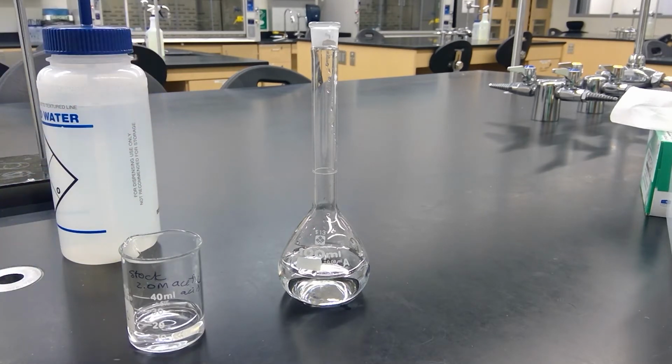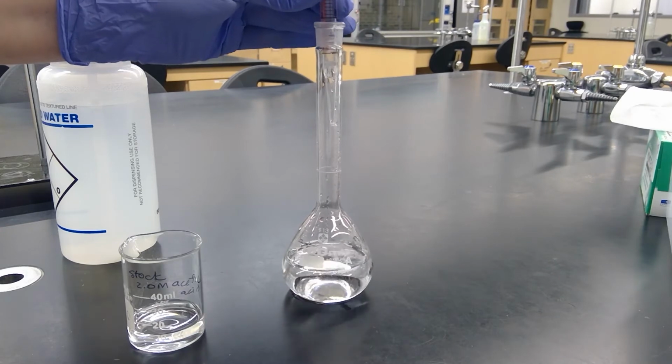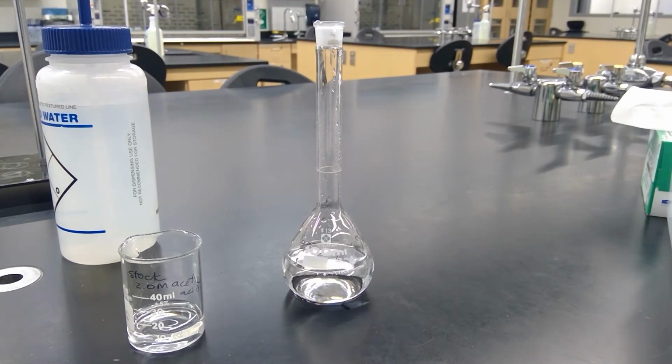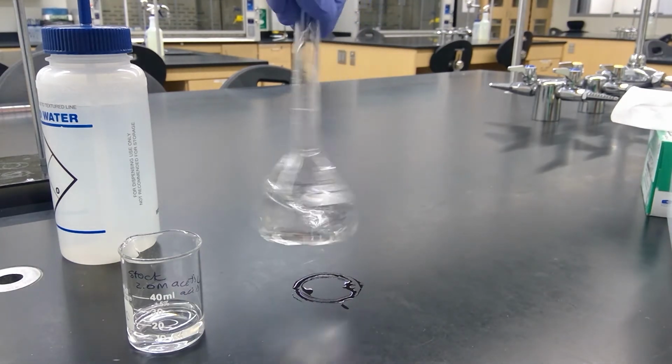And then you put it into your volumetric flask. And then you can swirl it to mix it.